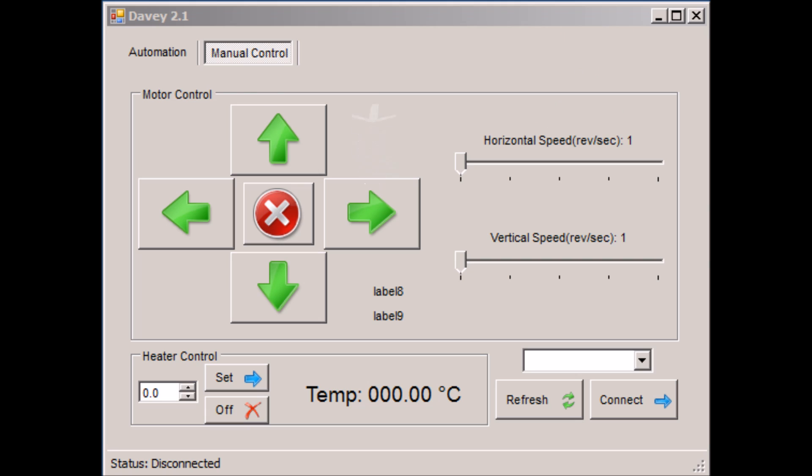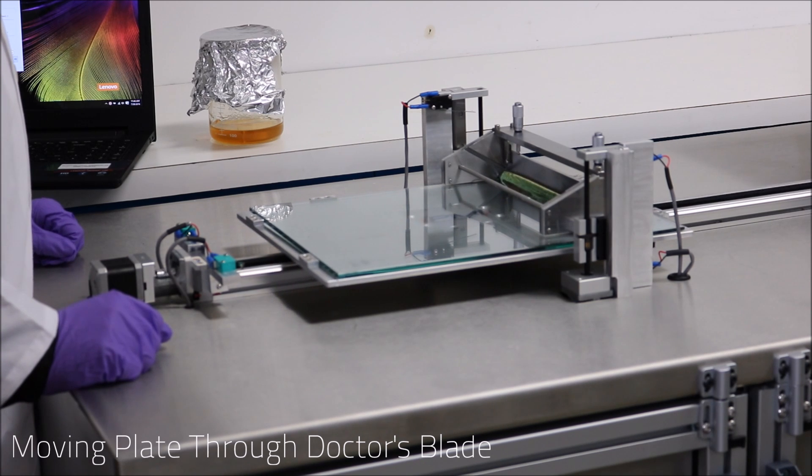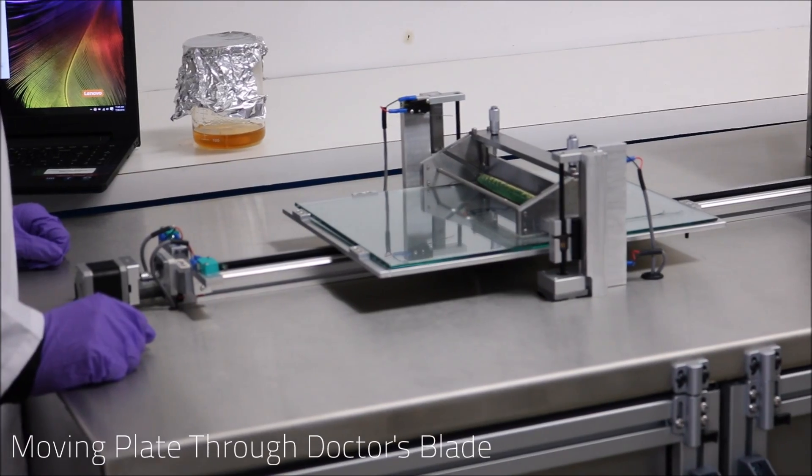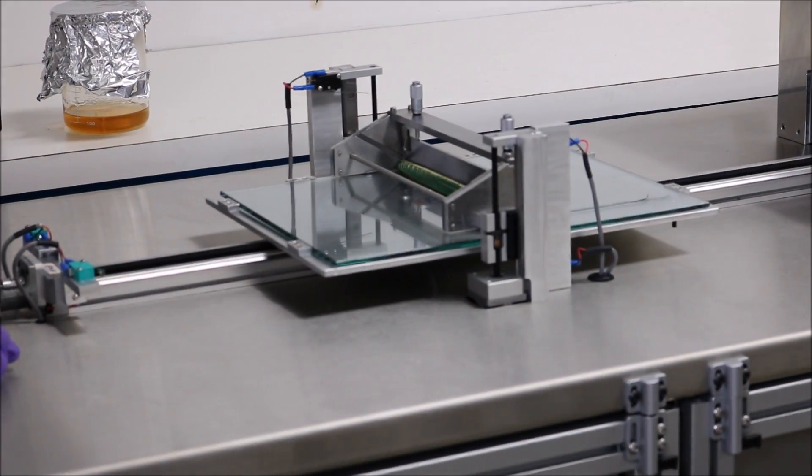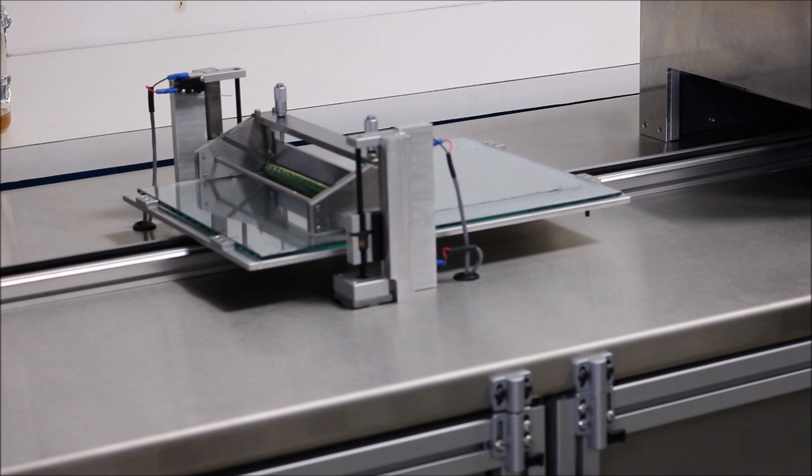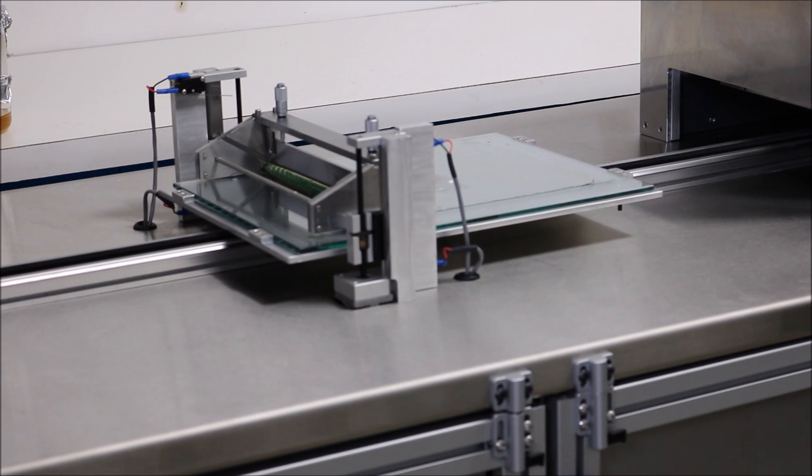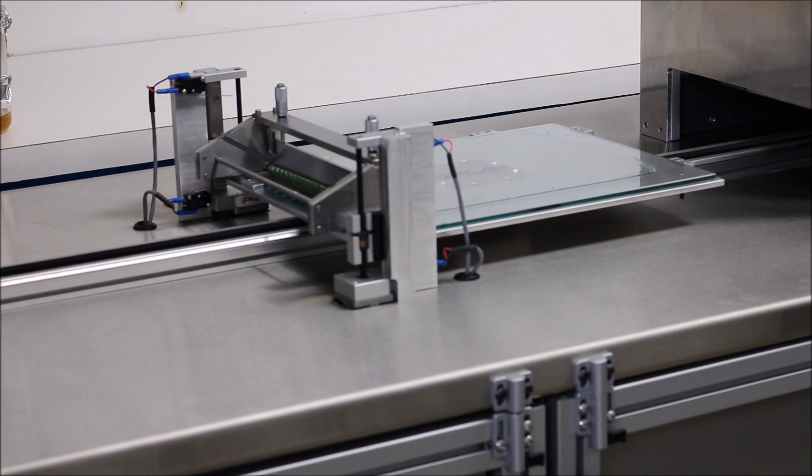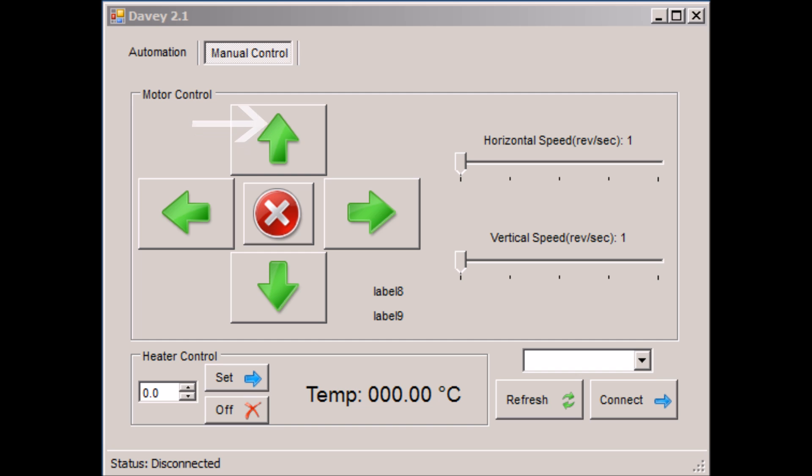Now we want to tell the program to begin moving the membrane casting plate through the doctor's blade. When the membrane casting plate is approximately all the way through, we want to stop and raise the doctor's blade up. This will prevent any excess polymer solution from falling behind.